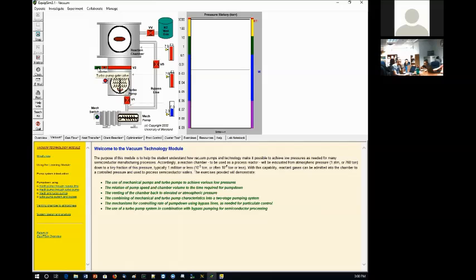So in this case, if I do that, let's open this valve, V2. And I turn on this turbo too, okay? In this case it won't work. It's not supposed to work. Even though it looks like it's working, it's not supposed to be working because it has a lot of load, 760. Turbo blades will not run. But in this simulation it is kind of working.